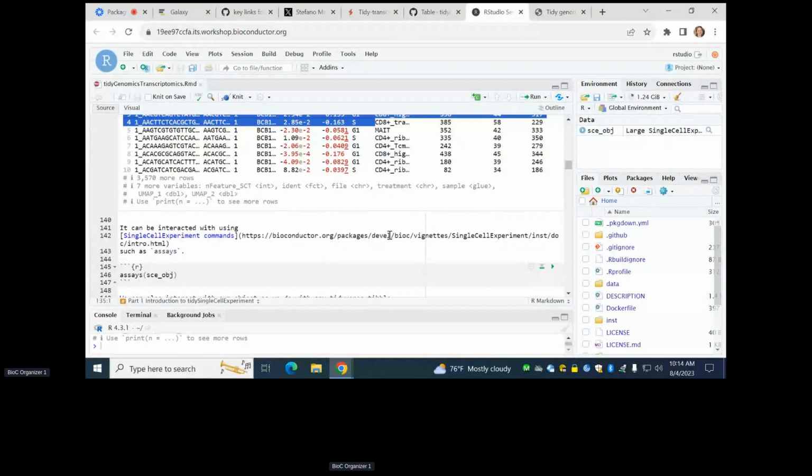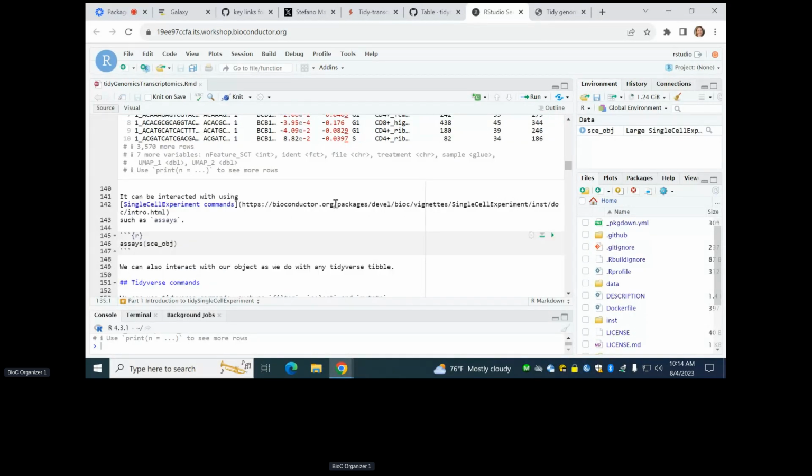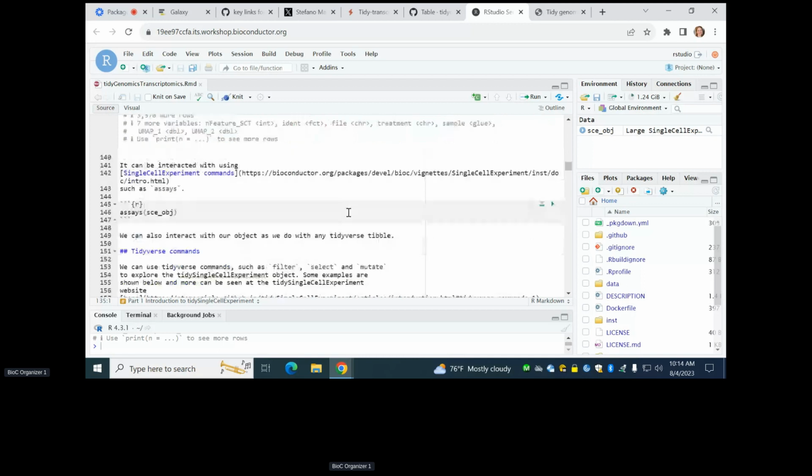This is an interesting question. I've never thought about generalizing that. Maybe it's possible, but S4 objects, for GRanges and SummarizedExperiment, are very heterogeneous. So we make them somehow consistent through this interface. I'm not sure if it's possible. Yeah, I've looked into it before. It's non-trivial. Yeah, I would imagine so, but maybe there is a magic bullet. I don't know. But it's a good question. It's worth thinking about that.